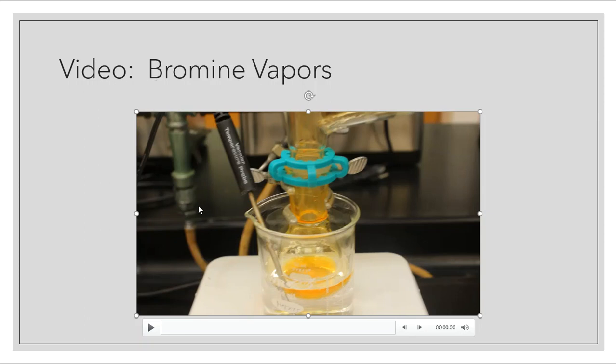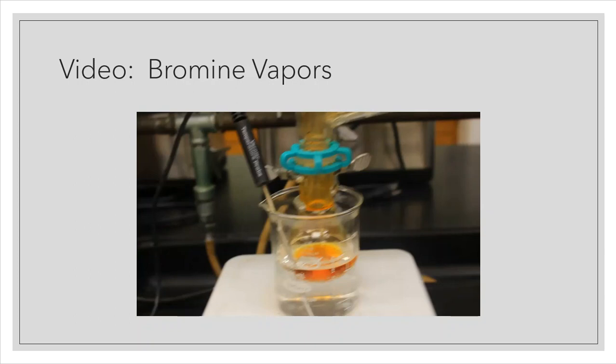So that's one of the common problems that people always have when they do this lab in person, is that they think it should go colorless, but at no point in time in the lab directions does it say that it actually goes colorless. It just says a light orange or a very light color. So they sit and they wait and they wait, and they're like, why is everybody getting finished? And I haven't even added my second portion yet. That's because you didn't read the directions.